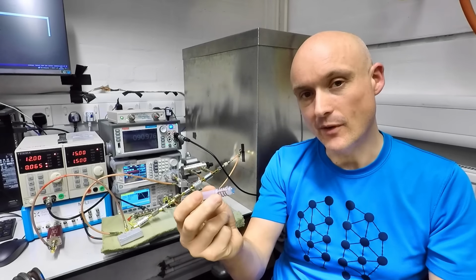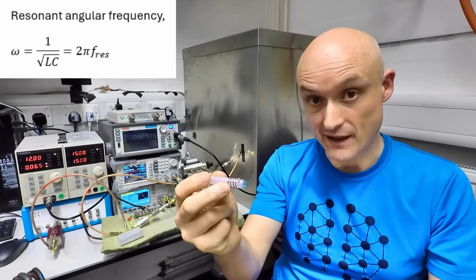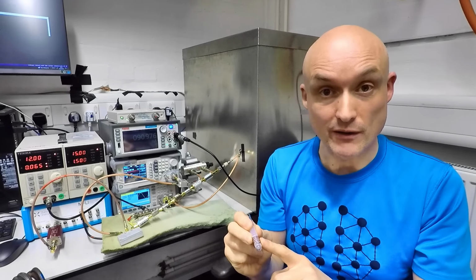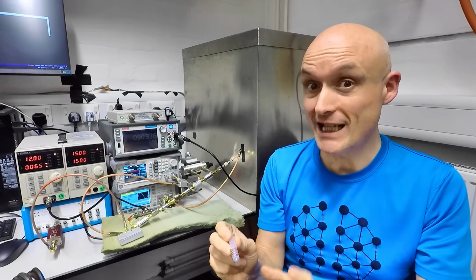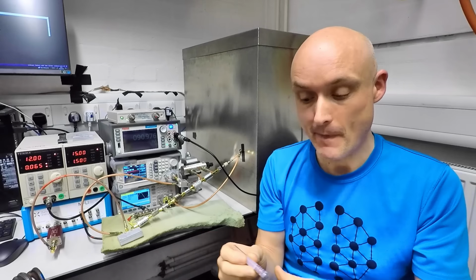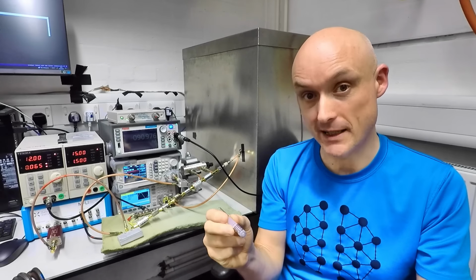This is an example of the resonators that we use to drive the oscillating magnetic field. Now, the way that we've designed these has undergone quite an evolution in the past few months, sufficiently interesting to have their own video, so watch out for that, it's coming up. For now, here are Eve and Lucy to show you how we make them.